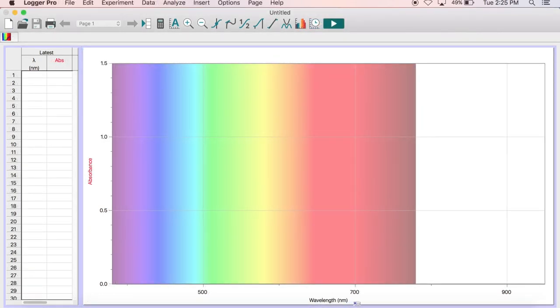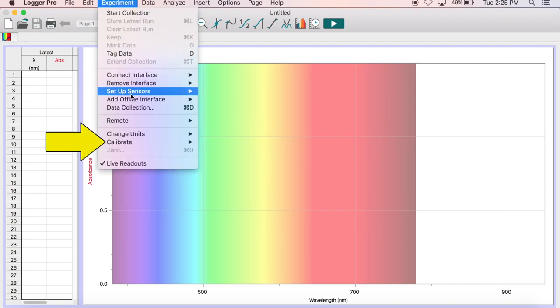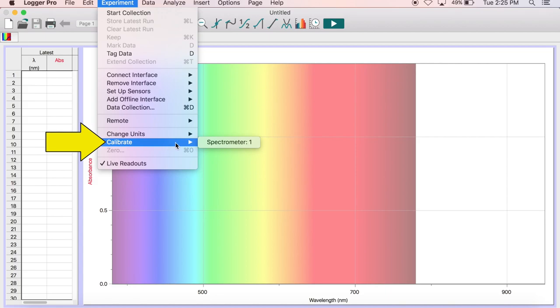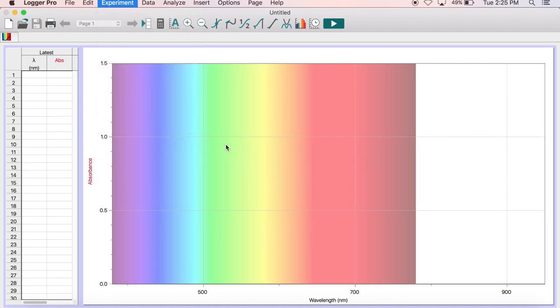Before you begin, you need to calibrate the spectrometer. From the Experiments menu at the top of the screen, select Calibrate, Spectrometer 1, and then wait 90 seconds for the lamp to warm up.